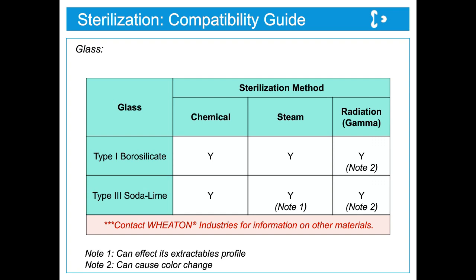Now, this isn't every type of glass. There's also type 2 glass, and there's type NP glass. If you want a full list of the effects of sterilization methods that could happen with those glass types, please feel free to reach out to me after the webinar, and I can give you some insight on that as well.